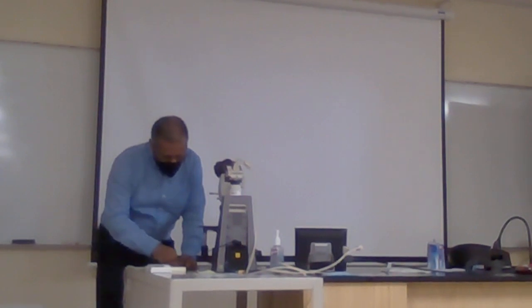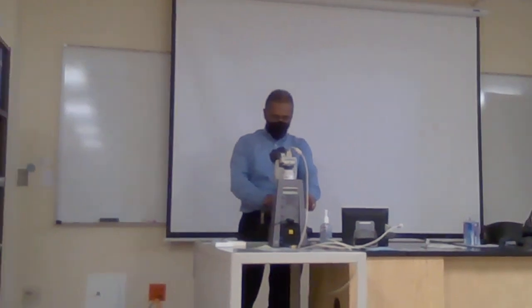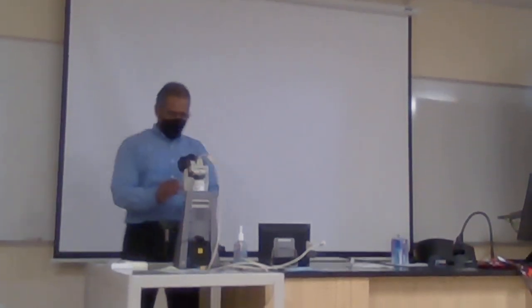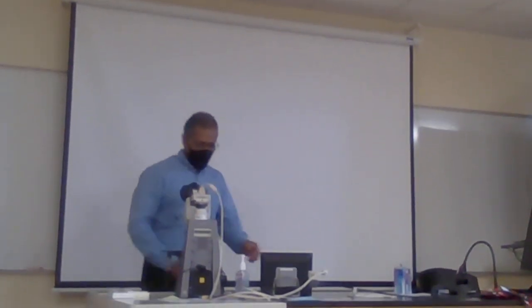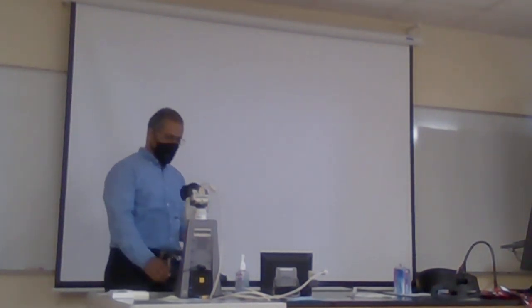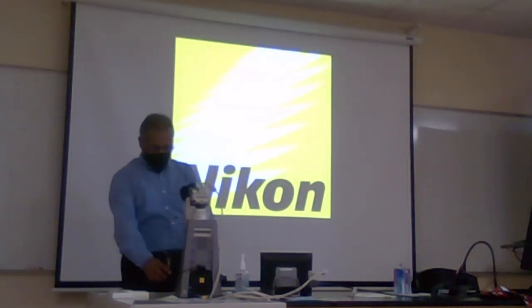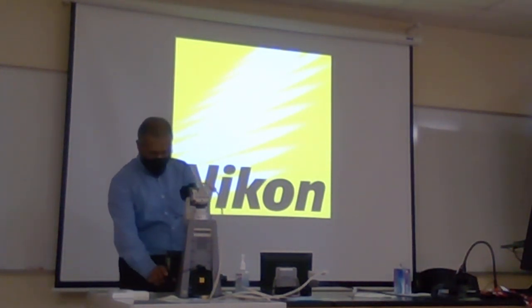So next we're going to look at the ovary. What do you expect to see in the ovary? Tell me two structures you're looking for in the ovary. Follicles. What else? Oocytes inside the follicle. Okay. Give me one more thing. Corpus luteum. So we're looking for follicles and corpus luteum, and if you're lucky, we should be able to find a tertiary follicle. And in a tertiary follicle, we should be able to see the oocyte with the zona pellucida and all of those structures.